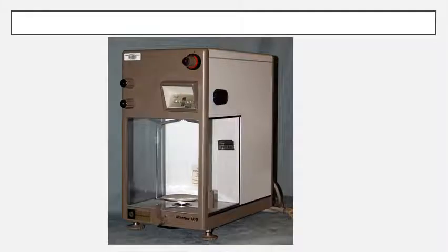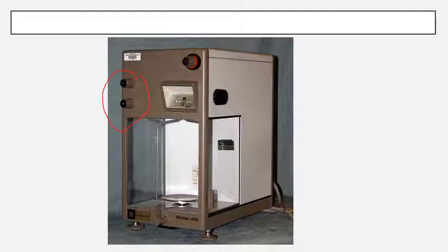This is the actual mono-pan balance. You can see the coarse and fine adjustment controls, the weight of the substance shown on the scale display, and the single mono-pan balance which is in an enclosure to prevent air disturbance. The substance is placed and weighed inside this enclosure.